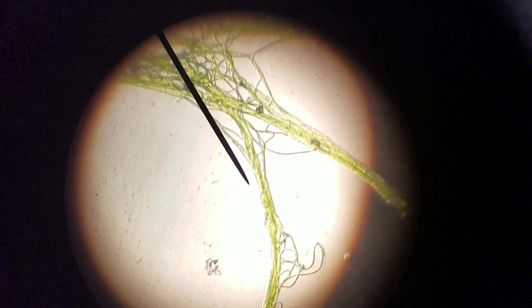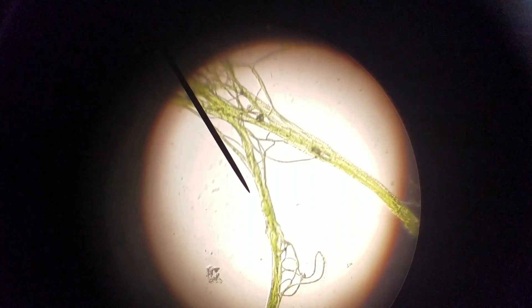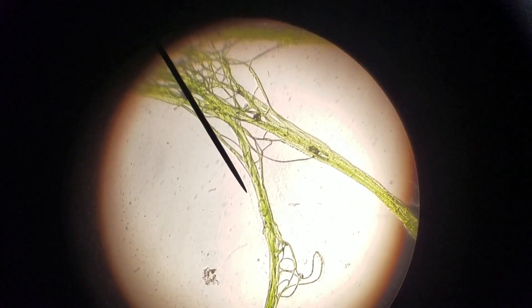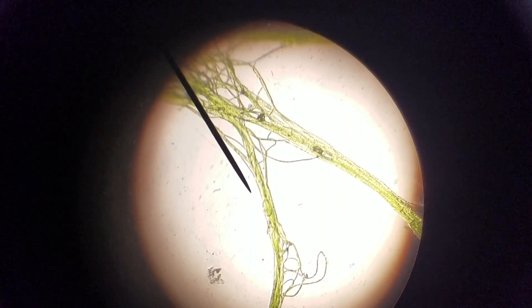If you look carefully — and sorry this is wobbly, there's not a good way to set this up without an LCD screen on the microscope — we are at 400 times zoom. This is the blue-green algae I scraped off my driveway, and if you look carefully you can see the filaments.